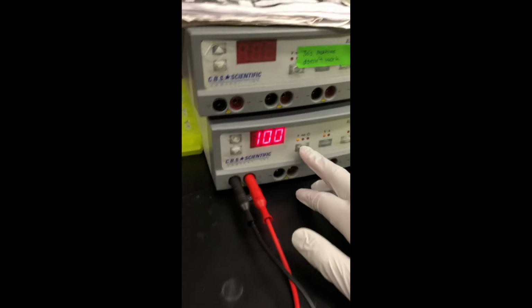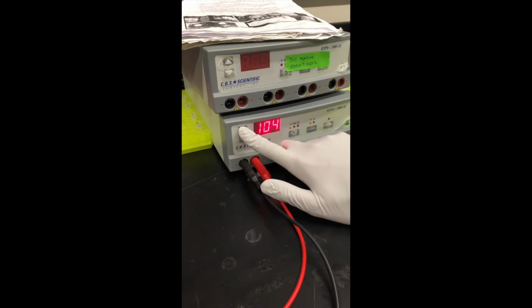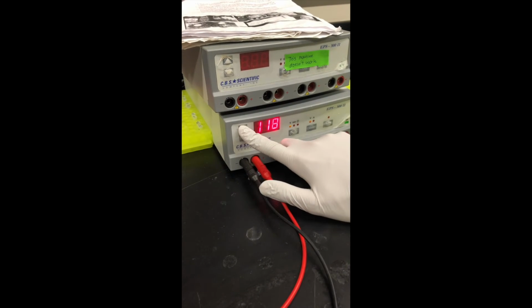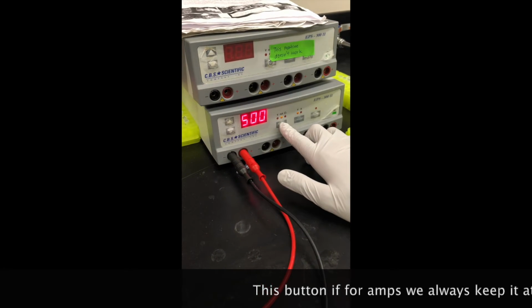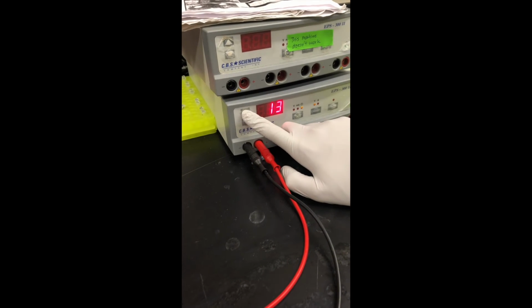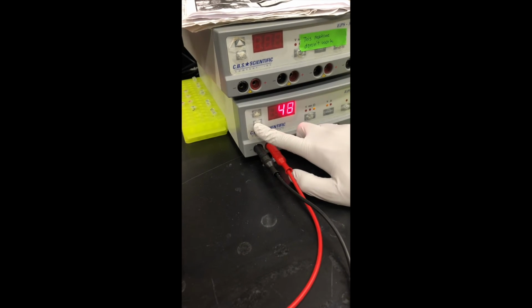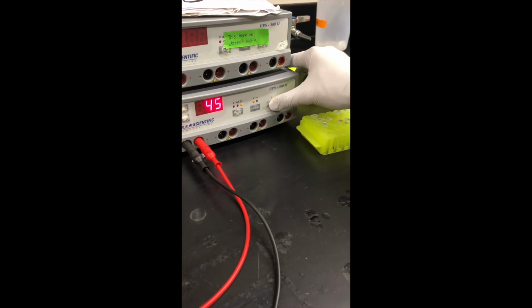So the settings we want to function on, we have our voltage at 100. We like 120 around these parts, to be honest. So we're gonna change that to 120. Our amperage is 500. And timing, this is a classic one right here. Everyone around functional genomics knows. This is a 45-minute endeavor. And then you just hit the start button, which is at the end.